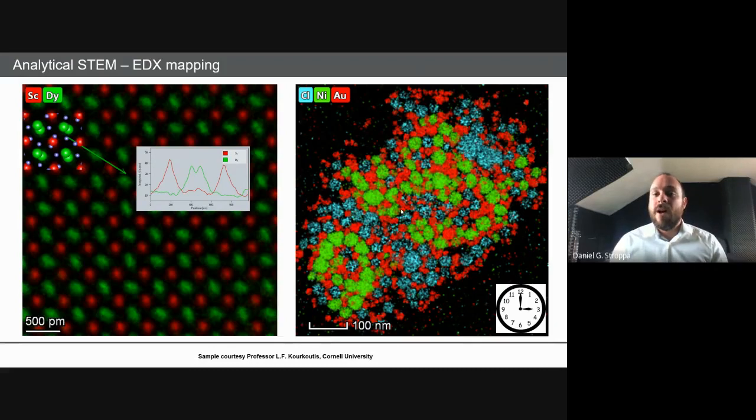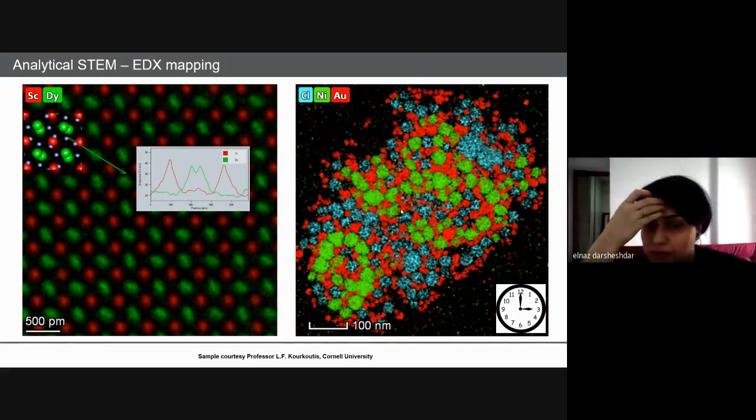For instance, for characterizing the size of material at nanometer size, is STEM more exact, or TEM, or both? I think what I see in the projects that I discussed is a bit of a combination.